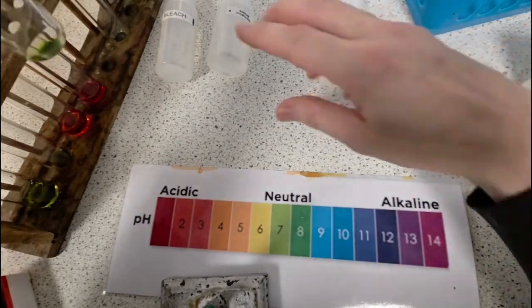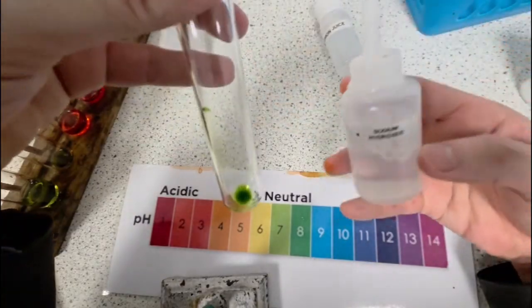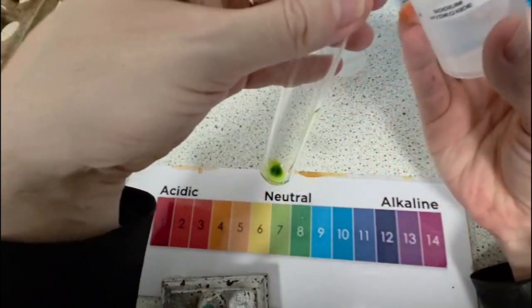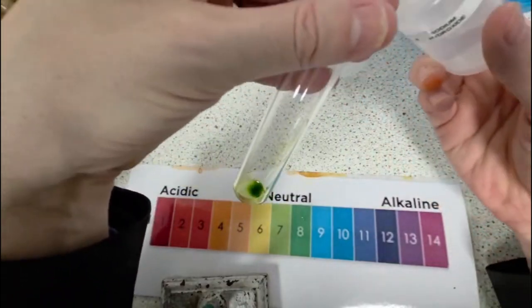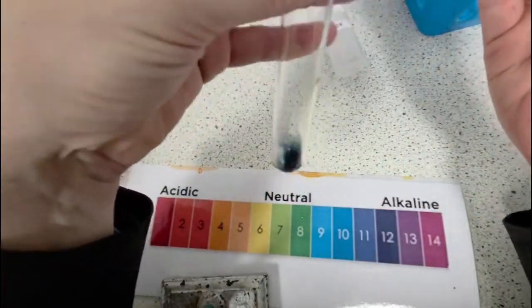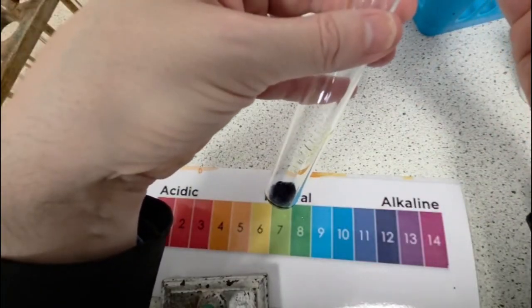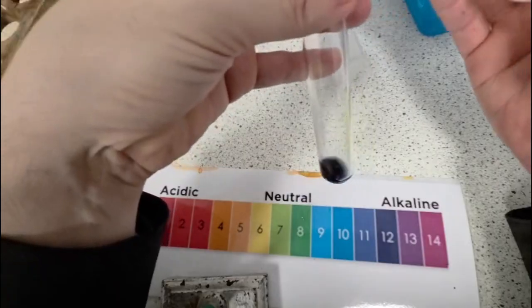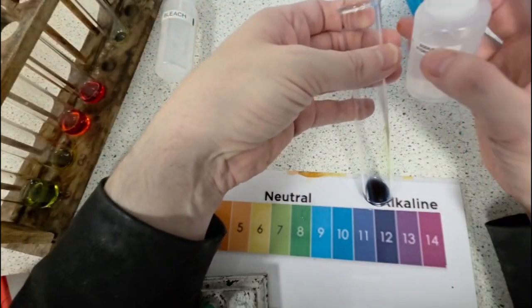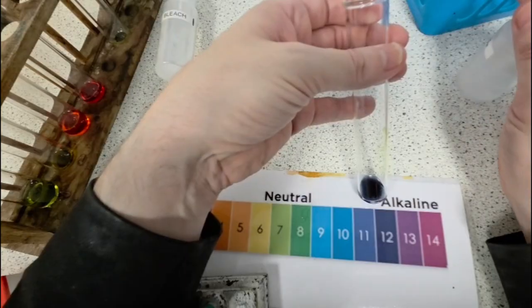Next, let's investigate sodium hydroxide. Again, if you watched our previous video on litmus paper, you'll have a good idea what color this might turn. But let's just pop it into the tube and find out for ourselves. Oh, straight away, a very, very dark purpley color. That's probably a pH 12 on this scale. So that's quite a strong alkali.